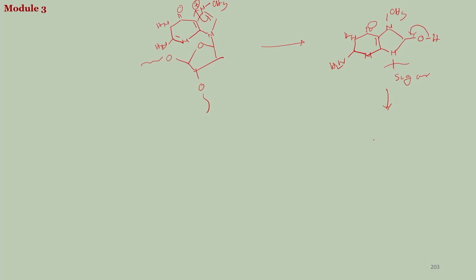And ultimately it chops it up, it will open up as, let us write, NCH3, this should be NH, and it would be the sugar, and here it would be CO. So, your nucleobase is cleaved, and now under the condition of piperidine treatment, this will be cleaved up, water will come here.